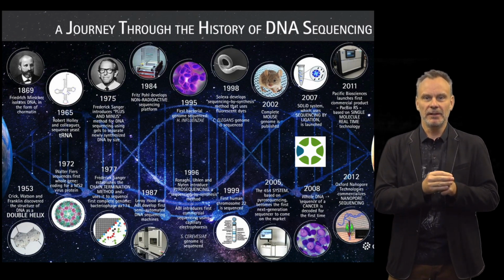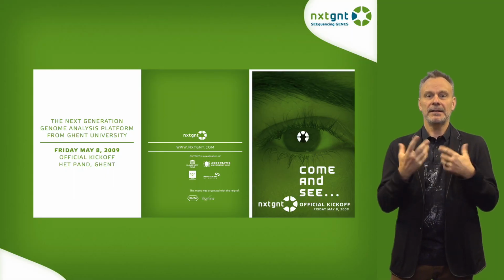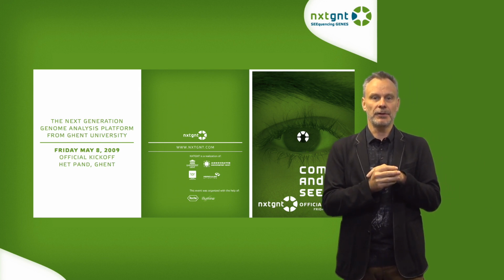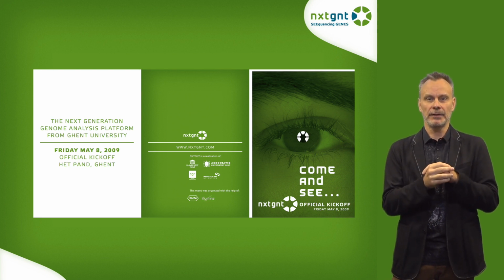It was in the middle of the NGS era that NXTGNT was founded in late 2008. NXTGNT was initially centered on two leading next-generation sequencing technologies, namely the Genome Analyzer 2 from Illumina and the Genome Sequencer 454 from Roche Life Sciences.